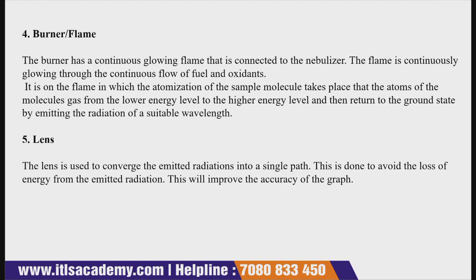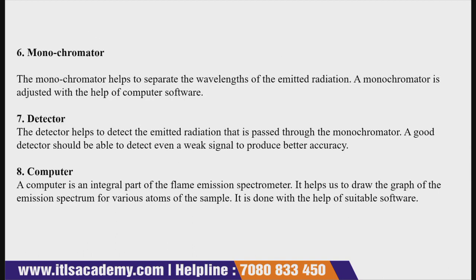This is done to avoid the loss of energy from the emitted radiation. This will improve the accuracy of the graph.